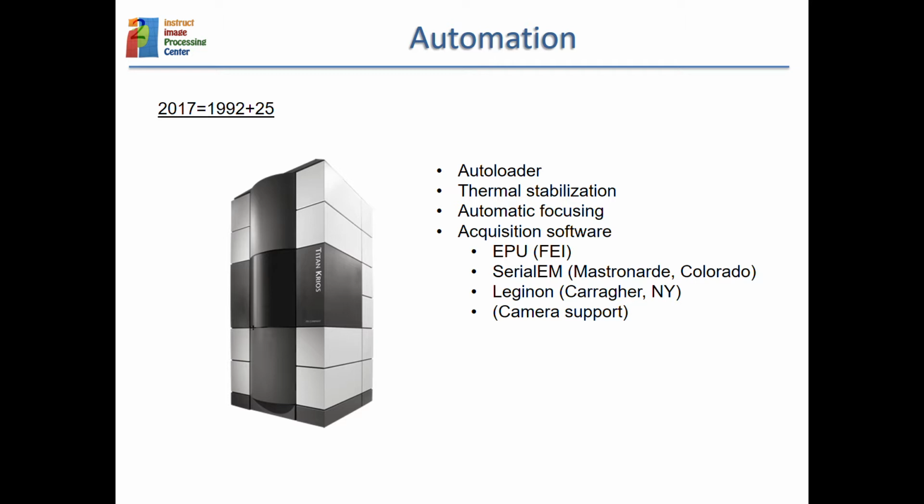The keeping of the grids inside the microscope is much more stable now, and even the thermal stabilization of the grid being imaged, so that there are no vibrations associated with thermal movement. Automatic focusing is also another big step forward. The acquisition software, and here I am mentioning a few.